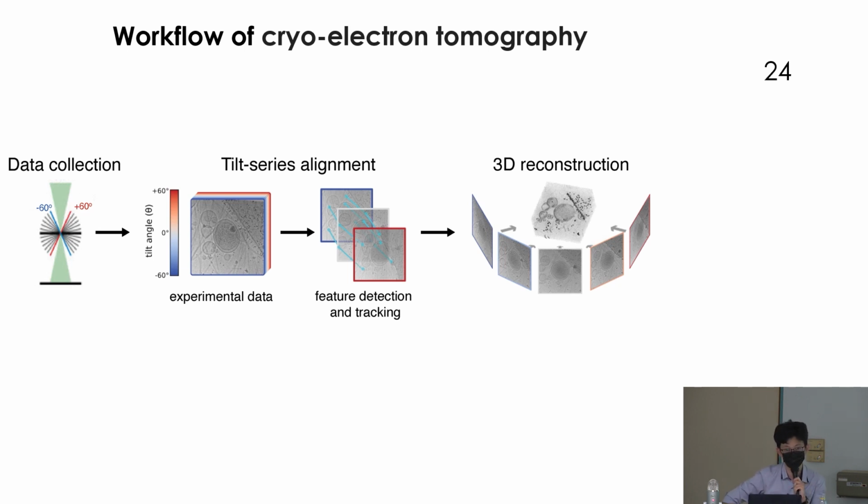So far we can only use plunge freezing. That's the best we can commercially have now, but there are many groups trying to develop more advanced devices in order to see more detail of the structure. Later on, next hour, we will have a group present this super cool time-resolved device to freeze samples.